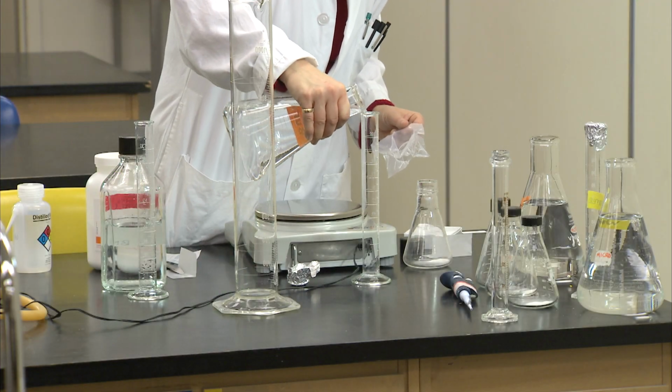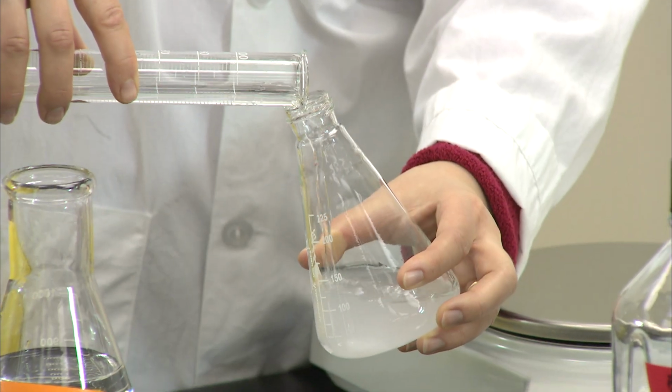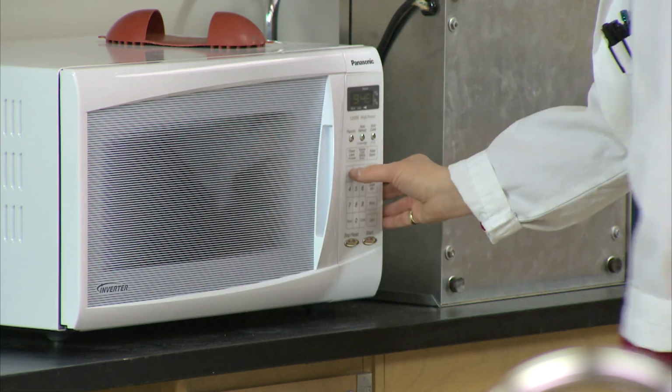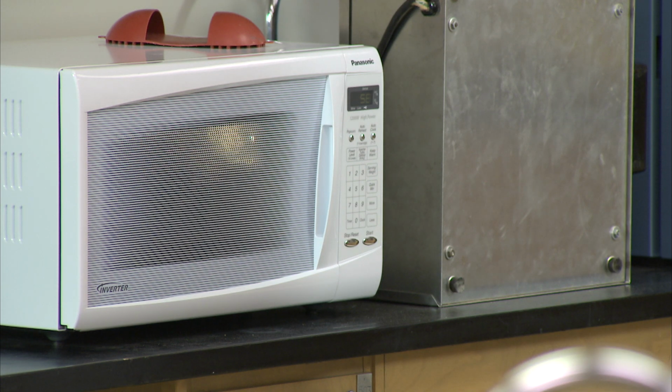When you are ready to make the gel, both the agarose and buffer are mixed into a flask that is heated to boiling to allow the agar to become molten. Be sure to watch the solution, as too much boiling can cause it to spill out of the flask.